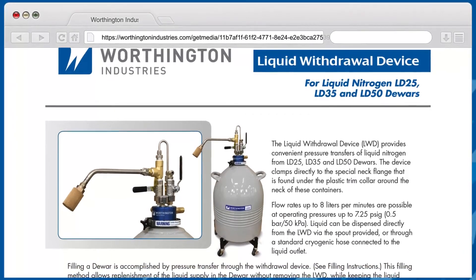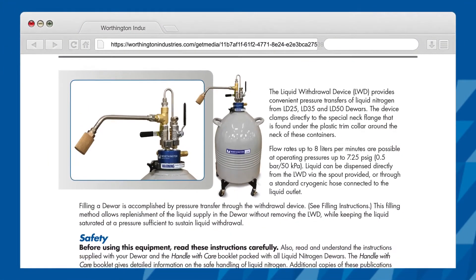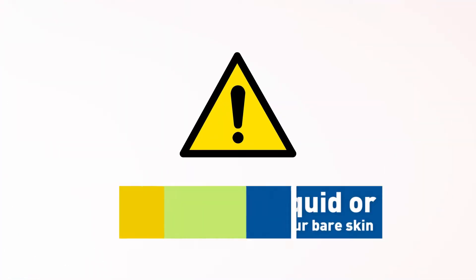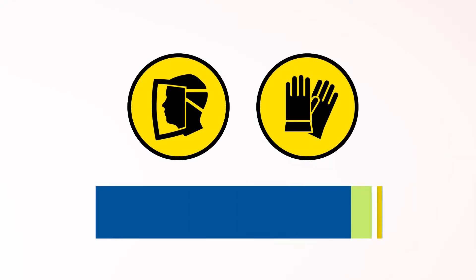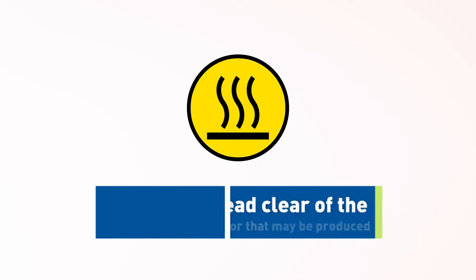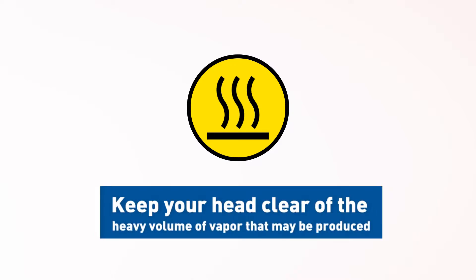There are some general safety precautions associated with utilizing liquid nitrogen. Do not touch liquid or cold metal surfaces with your bare skin. Always wear a face shield and gloves when transferring liquid nitrogen. Keep your head clear of the heavy volume of vapor that may be produced, as it is extremely cold and could cause personal injury.